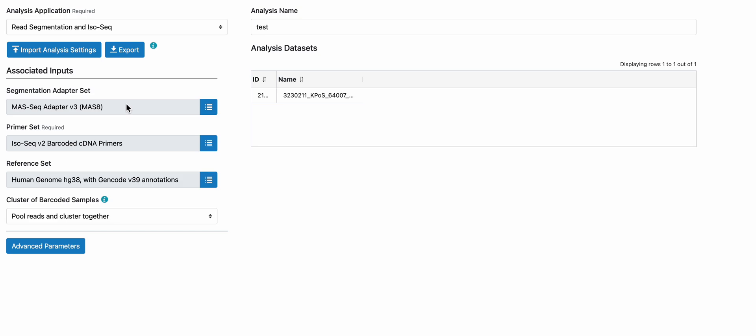The cDNA primer set has been preloaded to contain the 12 barcoded cDNA primers from the ISO-SEC Express 2.0 kit.